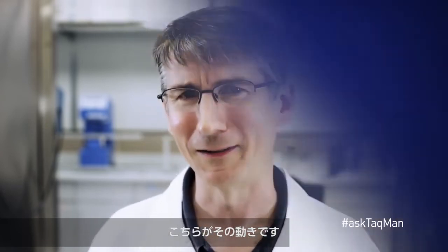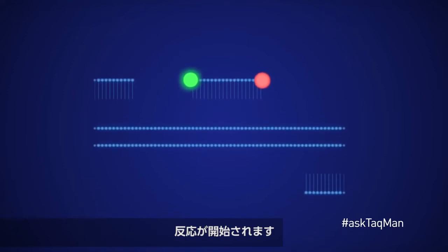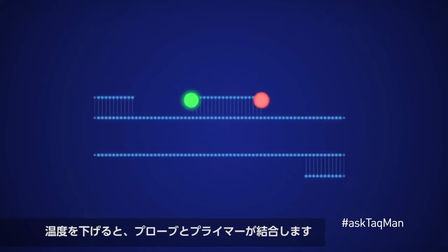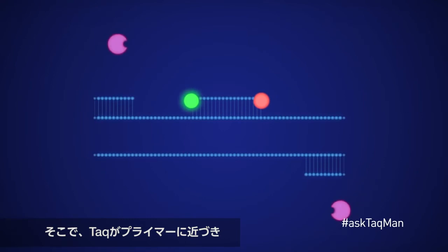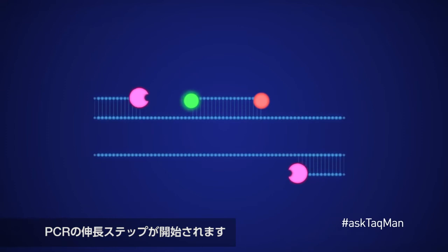Here it is in action. We begin our reactions by denaturing our template at a high temperature. As we lower the temperature, our probe and primers bind. Taq now comes in, finds the primers, and begins the extension phase of PCR by creating new, complementary strands of DNA.